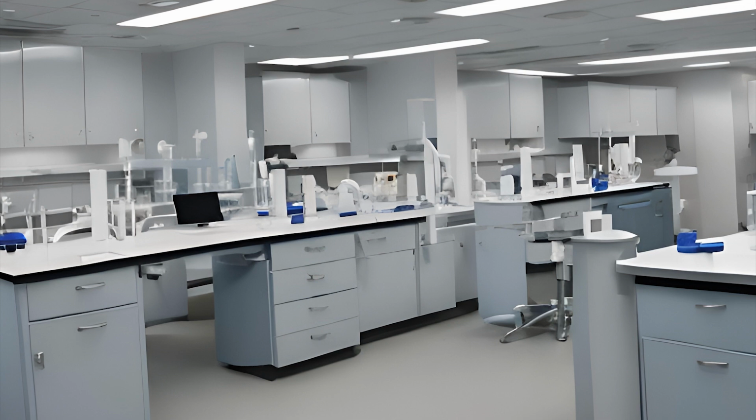Many laboratories, because of this guidance, are just going to set 2 hours as a blanket rule to cover everything when it comes to specimen separation. Regardless of the test you're performing, it is likely that your lab will just set as a policy that everything has to be separated within 2 hours.